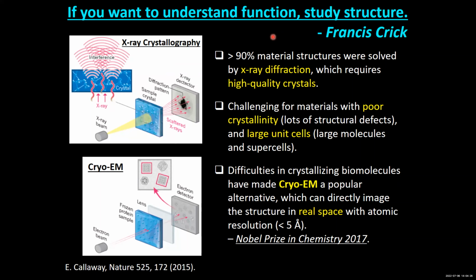So why do we want to use TEM to deal with the structure? That's because the diffraction-based method always requires high-quality crystals, and materials with poor crystallinity or large unit cells, such as those containing large molecules and supercells, give rather complicated diffraction signals, which can be challenging for structure analysis. For these materials, TEM offers a powerful alternative to directly image the structure in real space with very high resolution.